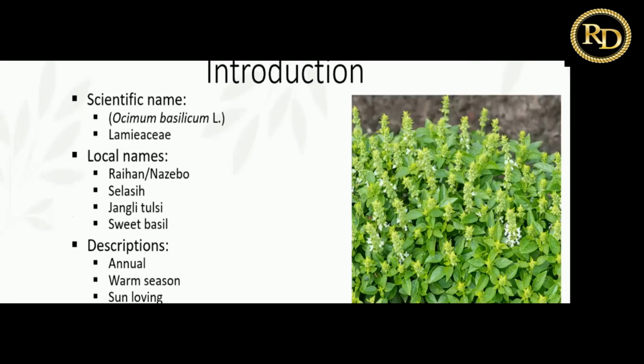Although sweet basil is rich in antioxidant compounds, the quantity of those compounds depends on the extraction technique. The efficiency of extracting plant metabolites depends on a few factors, with temperature and concentration of solvent being the main contributors.